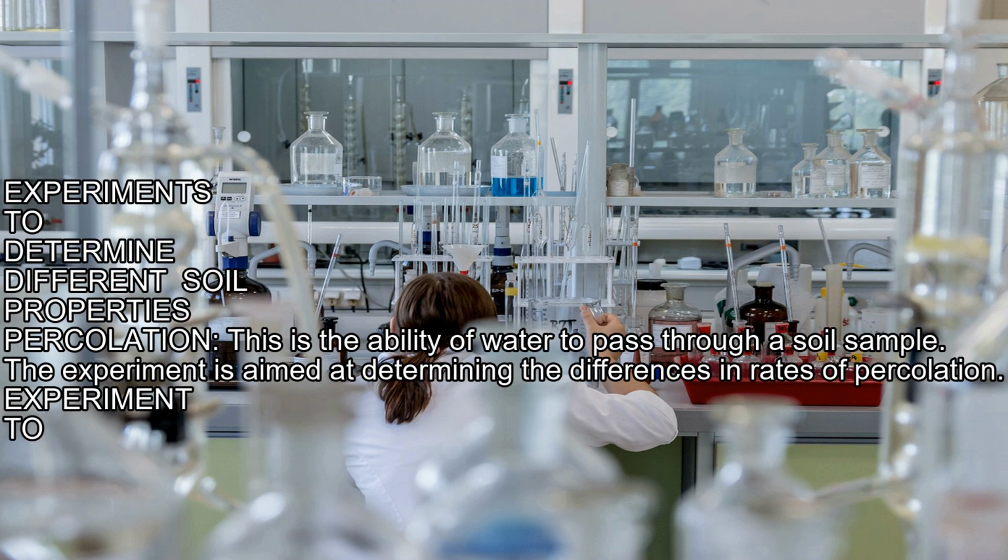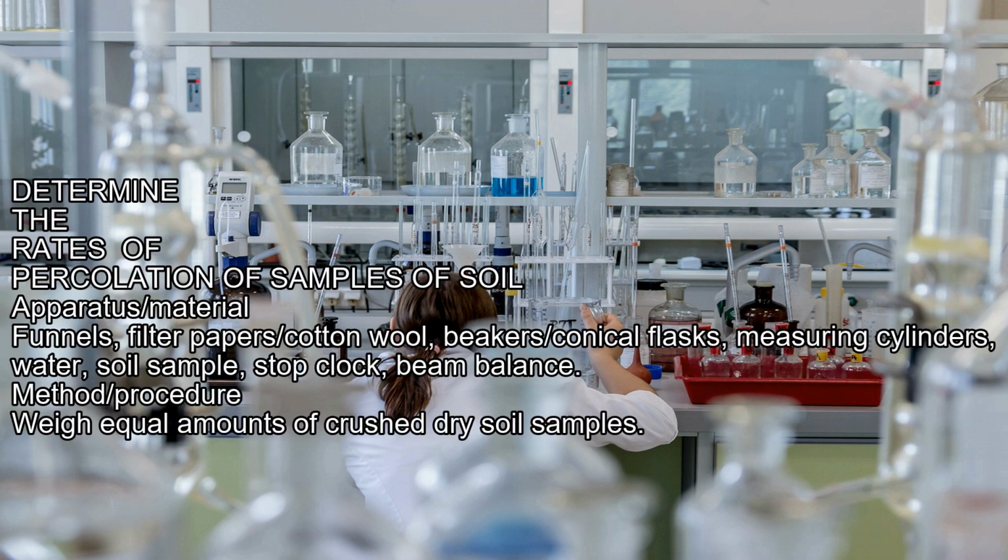Experiments to determine different soil properties. Percolation. This is the ability of water to pass through a soil sample. The experiment is aimed at determining the differences in rates of percolation. Experiment to determine the rates of percolation of samples of soil.